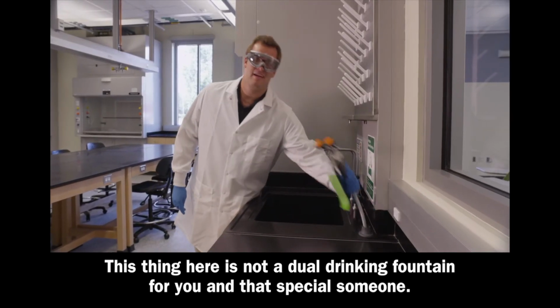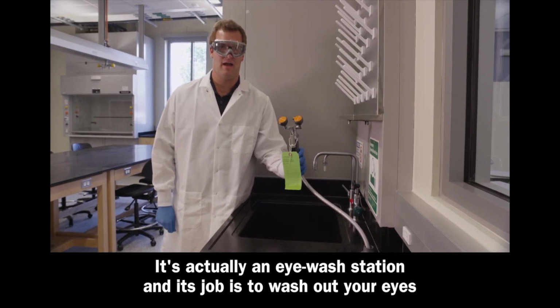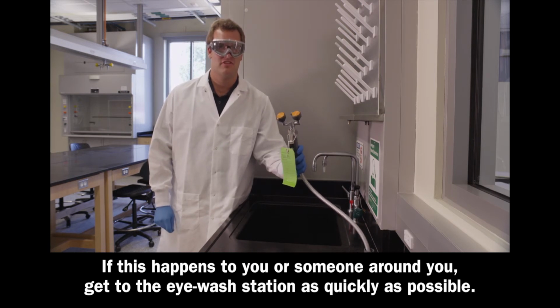This thing here is not a dual drinking fountain for you and that special someone. It's actually an eye wash station, and its job is to wash out your eyes if they've been splashed with any chemicals. You'll know this has happened if they really burn and hurt. If this happens to you or someone around you, get to the eye wash station as quickly as possible.